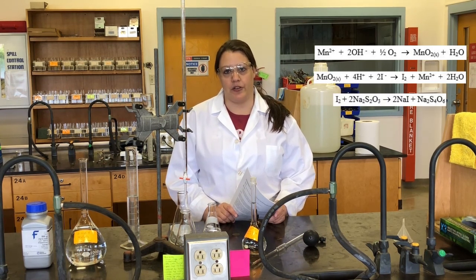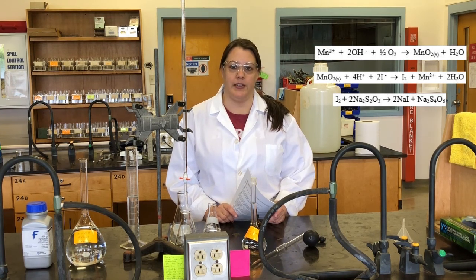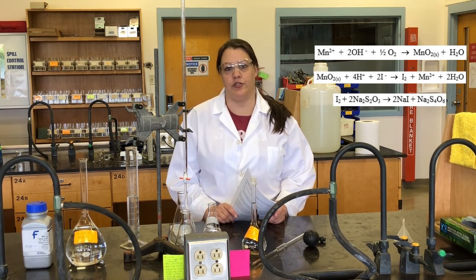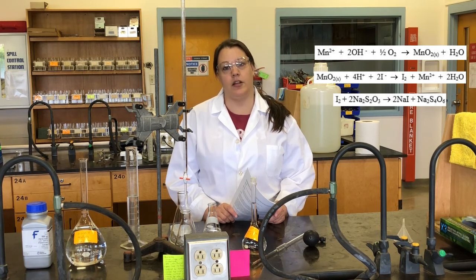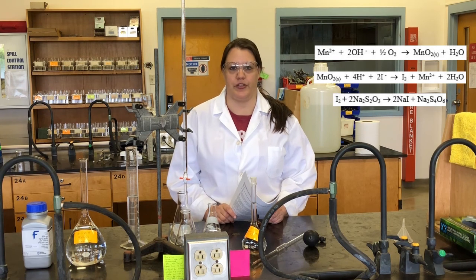And then we do a titration to measure the amount of iodine in our sample. And that amount of iodine that we determine, that's equivalent to the amount of dissolved oxygen in our sample. So that's the basic principle of how Winkler titration works, and you can see more details on that in your lab manual, of course, as well.